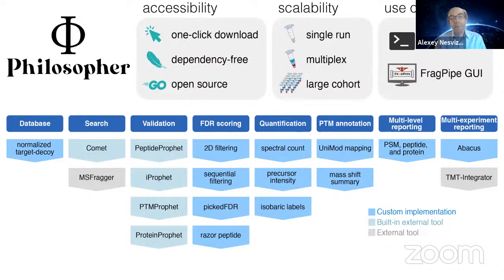And once we got this in place, we realized that we are also working on really new algorithms for label free quantification, that we have DIA workflows and so on and so forth, that we really pushed ourselves to create FragPipe as a complete workflow covering all workflows really. So again, it started with a pretty modest graphical user interface and developed into a full-fledged, complete computational environment.